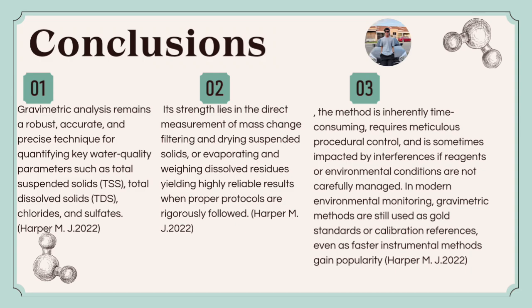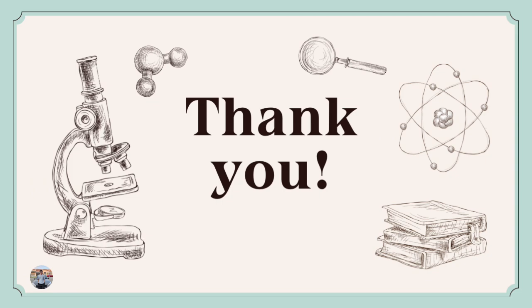They are often considered the gold standard or used as calibration references because of their reliability and consistency. So, even in today's world of high-tech tools, gravimetric analysis continues to play a valuable role in environmental monitoring and quality assurance.